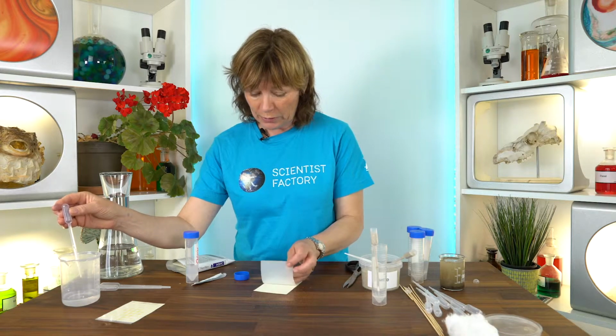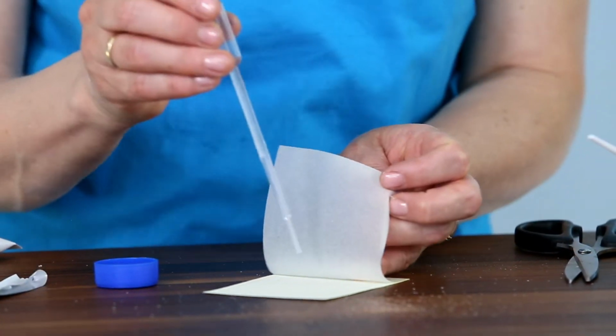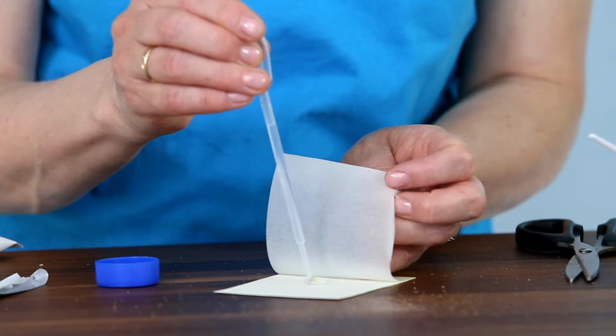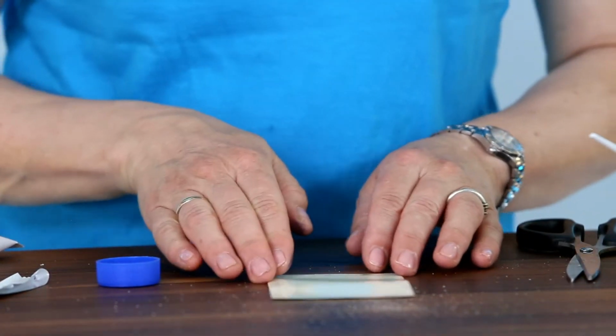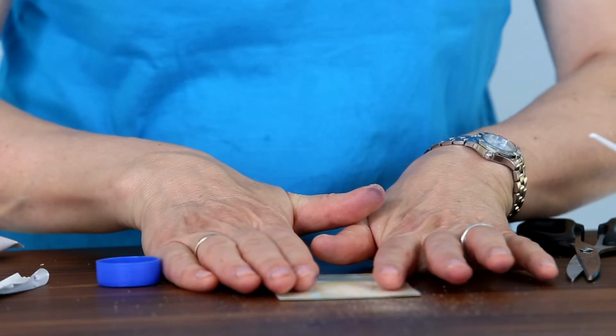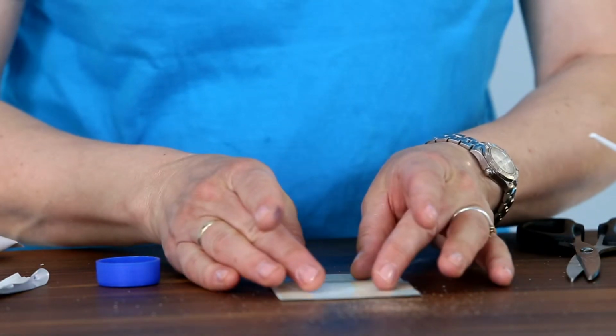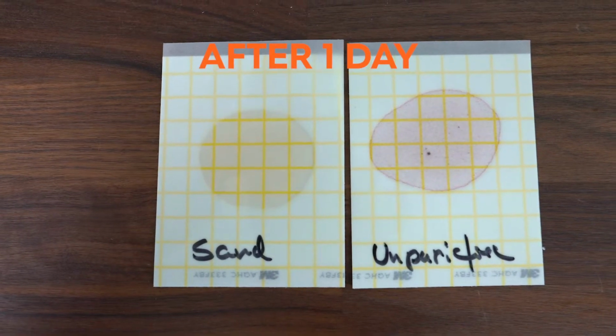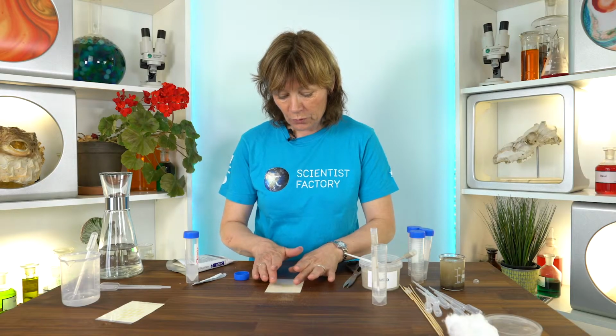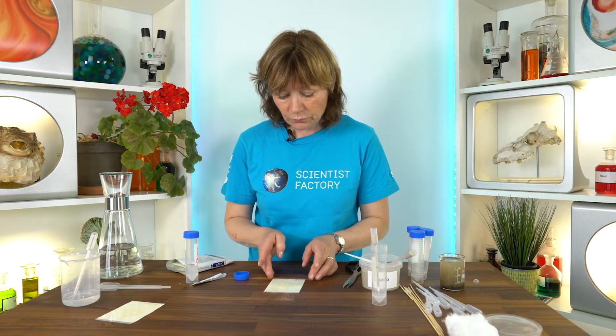Every group adds 1 milliliter in the middle at the same time, like this. And you carefully push down the top to make the water spread evenly on the Petri film.